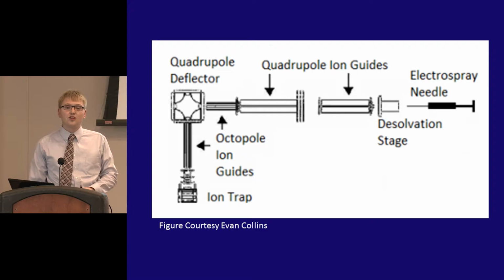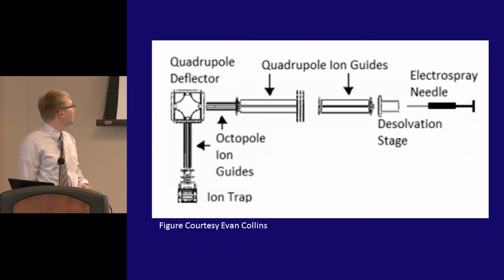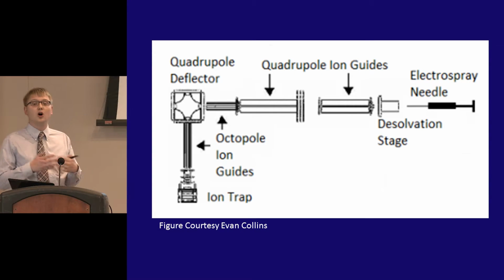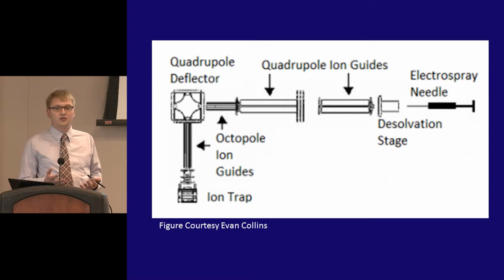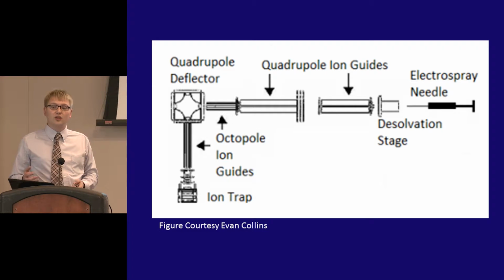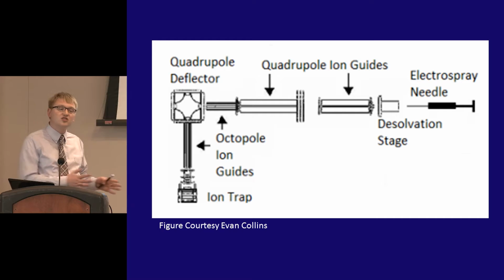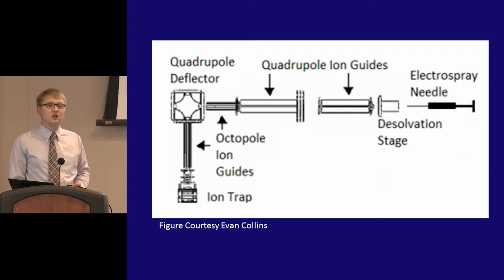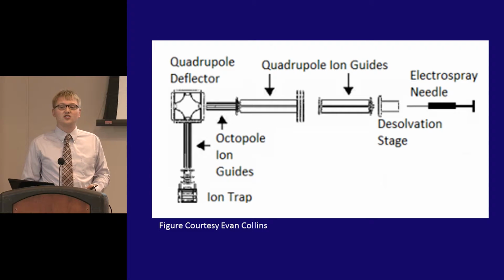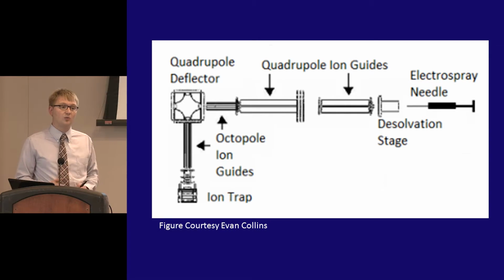The ion trap is really the heart of the entire apparatus. Electrospray is a source that's continuous. It produces ions all the time, but at a weak rate. The ion trap allows us to accumulate all those anions and then release them all at once. We need this because our magnetic bottle spectrometer is intrinsically pulsed. It requires that it receive a bunch of ions all at once instead of a steady stream over time. So, how does an ion trap work?